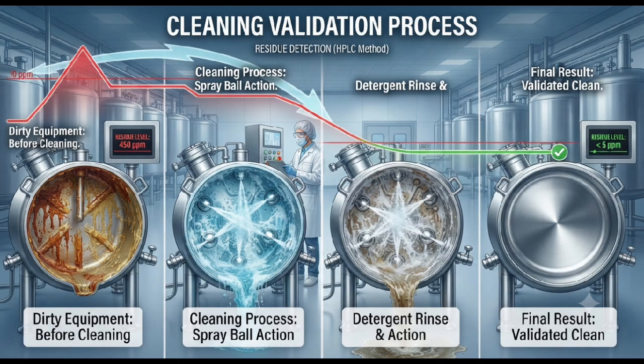Introduction of CMV, cleaning method validation. Cleaning method validation is the documented evidence that a cleaning procedure consistently removes product residues, cleaning agents, and microbial contamination to predefined acceptable limits. The goal is to ensure that equipment used for manufacturing one product does not contaminate the next product.